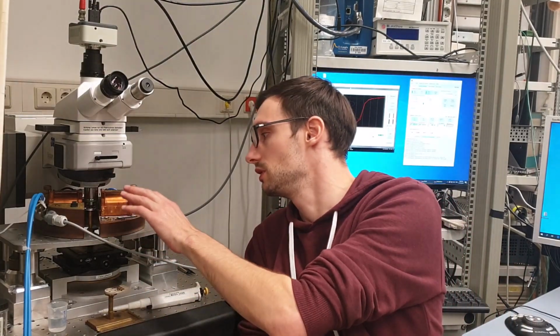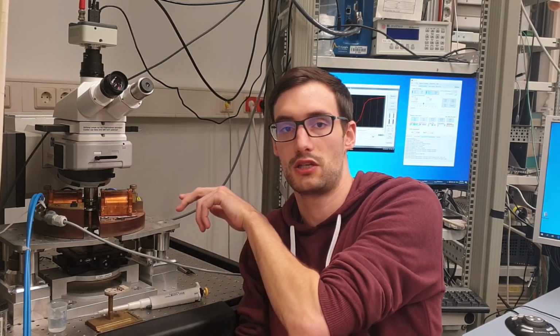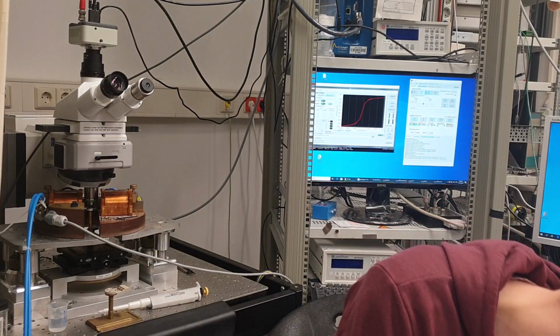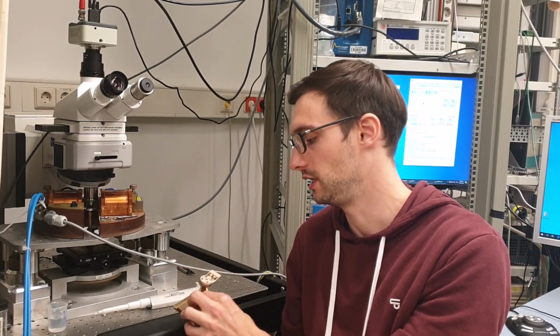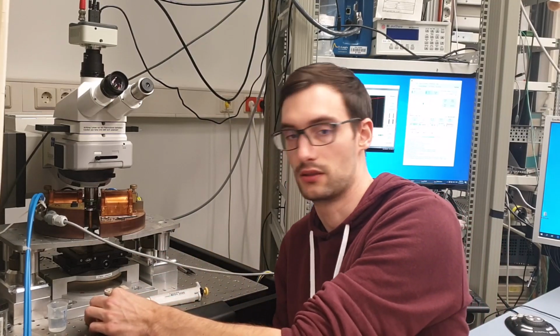So in our case, we use a magnet which gives an in-plane field, because we are interested in a sample which has a magnetization in the film plane, but it's also easily possible to change the magnet to a magnet which gives an out-of-plane magnetic field for samples which have a magnetization out of the film plane. It's also possible to measure at lower temperatures, and it's also possible to track some electrochemical reactions on magnetic thin films with a special electrochemical cell, which I come to in a second.